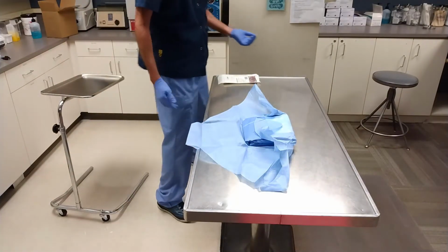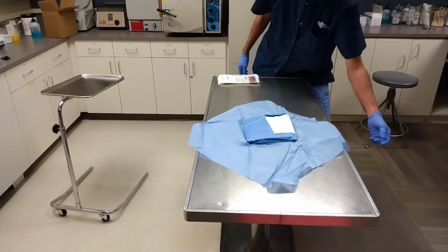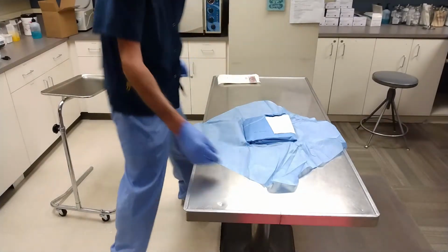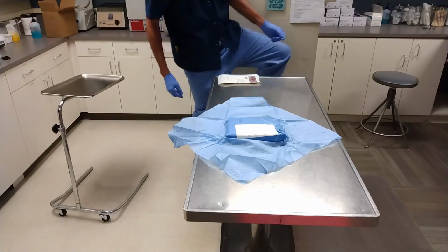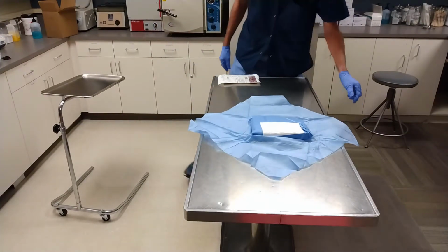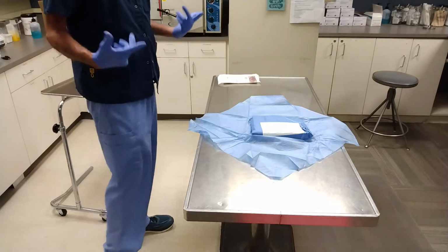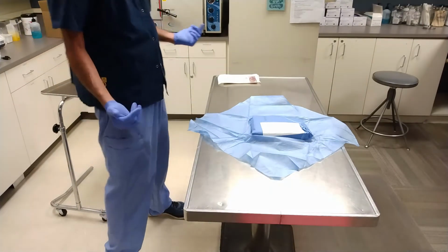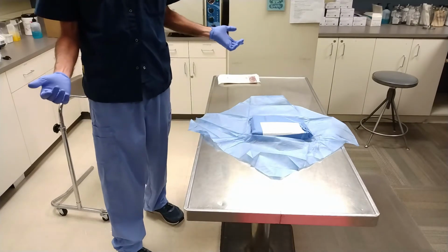I don't want to pass over it, so I'm going to come over here. Hold out. Okay. And then I just want to arrange this so the person who's scrubbed in can come and don it without touching anything. So see, there's a towel, and it's just totally sterile. I'm not even going to talk over the top of it.